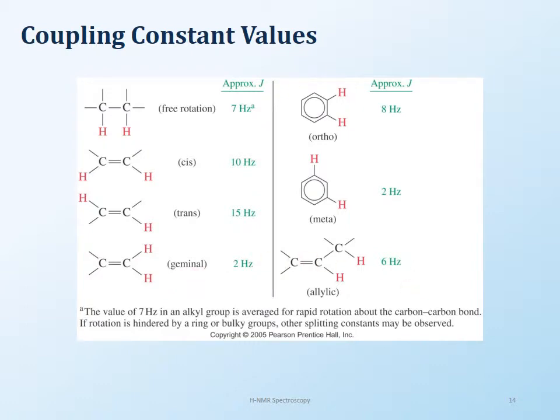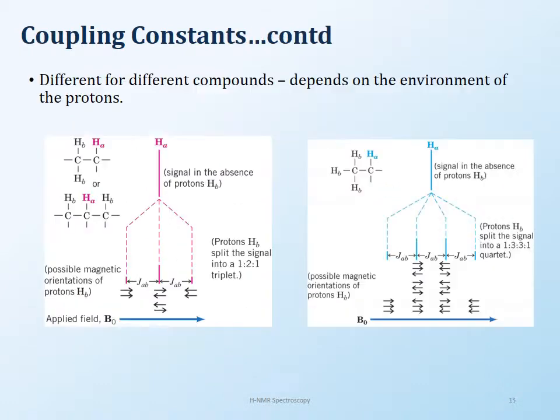Now, technically speaking, at this level we don't do so much with coupling constants, but you just get an idea of what this is about. And so you can see how we can use NMR to figure out the exact structure, and the coupling going on in an NMR.